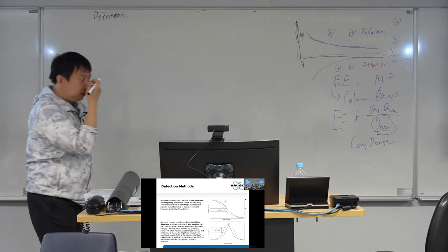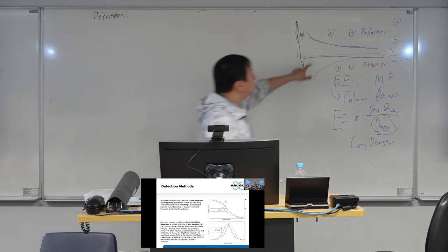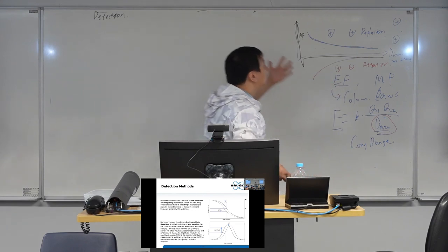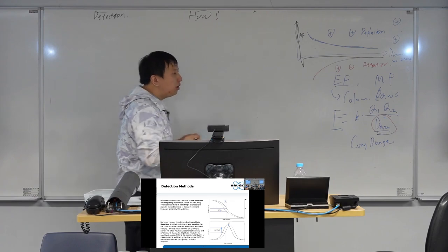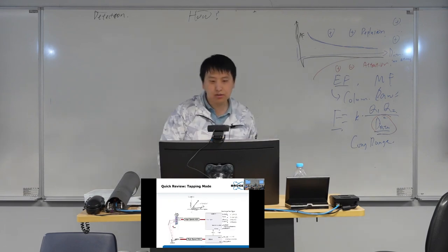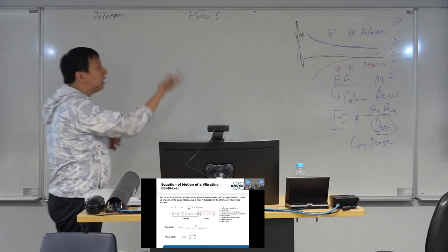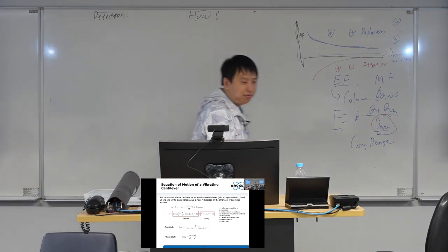So the idea here is we use the lift to measure the so-called long-range electric field force. So how do we use the AFM setup to measure this electric field force? Let's jump this way. We will go back to the mathematics a little bit.